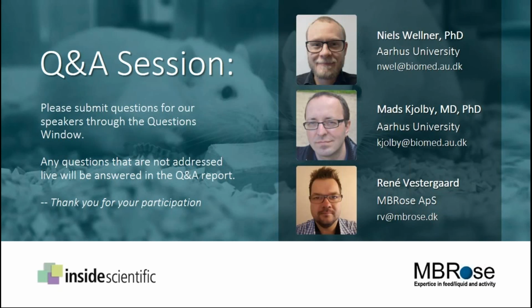That makes sense. Renee, do you have anything to add to the answer that Niels and Mads have just provided? No, I think that's very nicely explained, because it's the metal slider. Then you'll have to do it manually to close the channels. So of course that's a possibility. As Mads was talking about, if you have a good PhD student, then they could do these procedures.